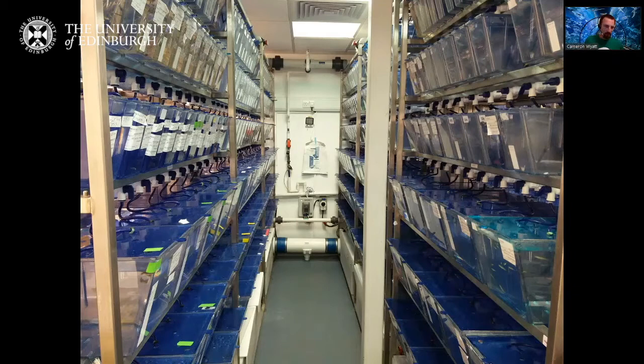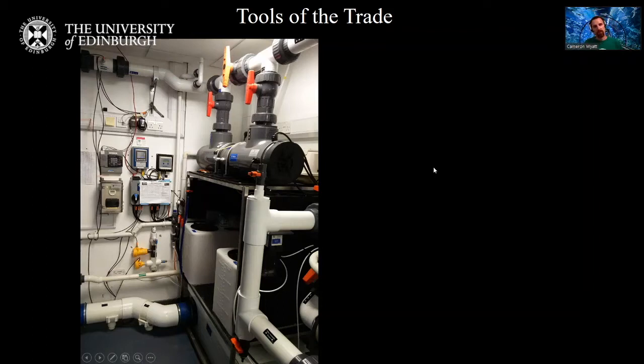We have the capacity for something around 30,000 fish, but we generally don't run at maximum capacity, maximum density. So it's usually closer to about 10,000 fish at any one time. So how do we support this system, this big aquarium? Well, it's a recirculating system, so the water constantly circulates through it, and it has to be adjusted and cleaned. It's basically the same as keeping an aquarium at home, but you have to keep much tighter control over it because there are thousands of fish involved.